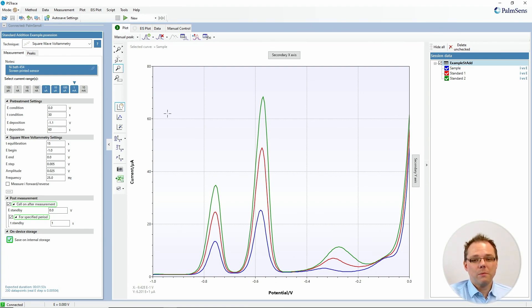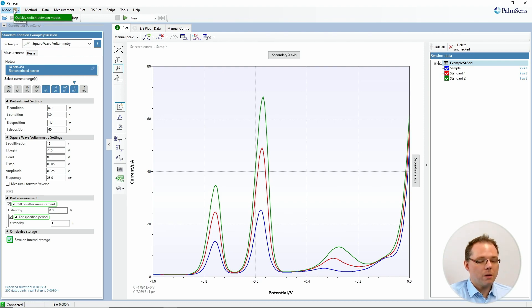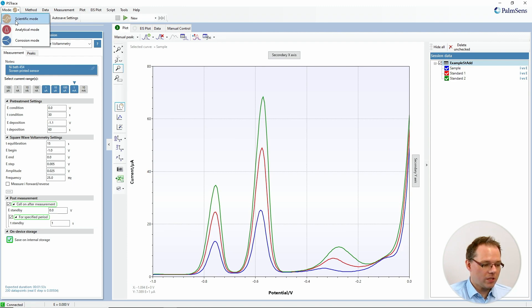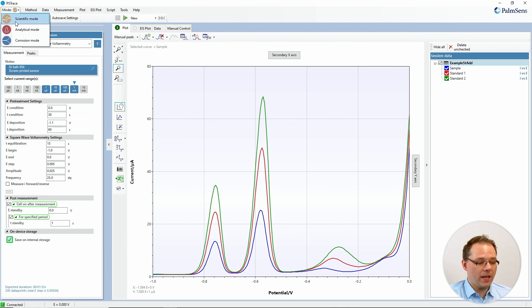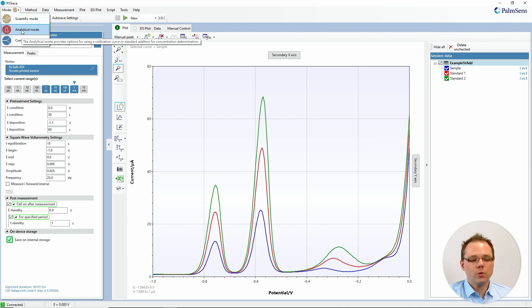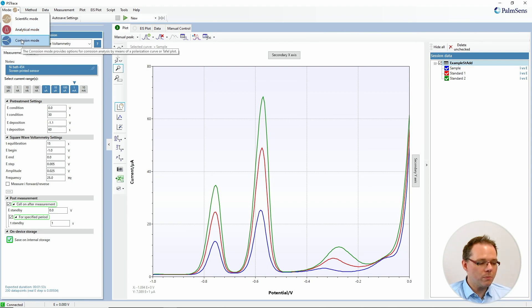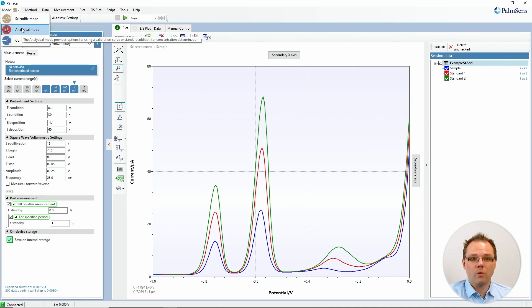I've already loaded some curves, but first let's find out how do we switch the mode in PSTrace. Most people use the scientific mode, which is this little gold icon, and that is the mode that allows you to basically use all the functions that are there. The analytical mode is a mode that helps you use it for standard additions or for making calibration curves and then using the calibration curves to calculate from your sample the concentration. The last one is the corrosion mode, which is especially helpful for people who want to perform TAFL analysis.